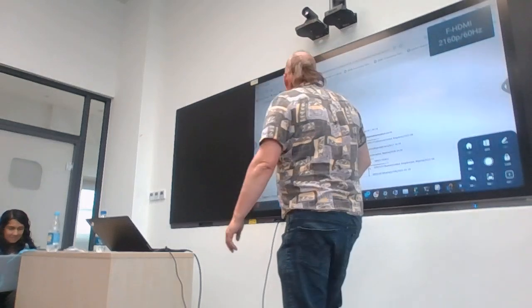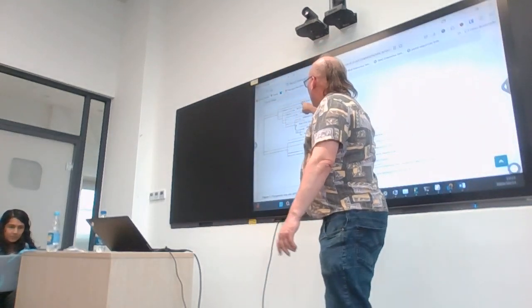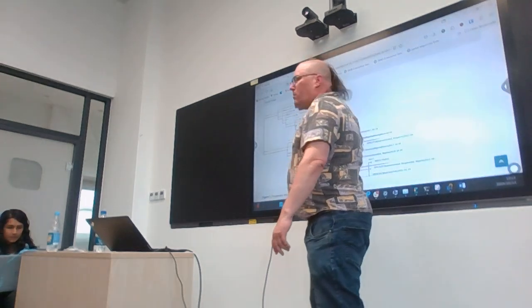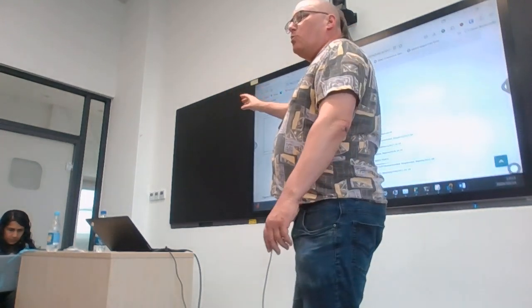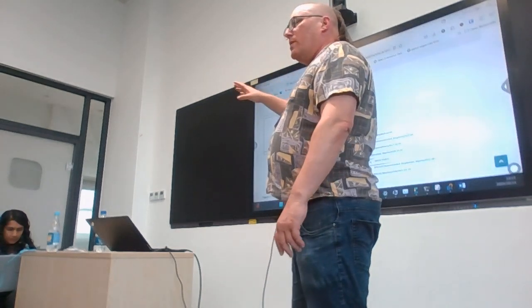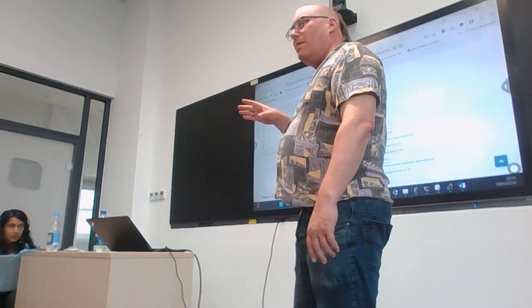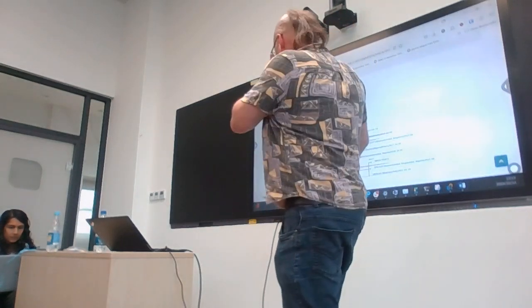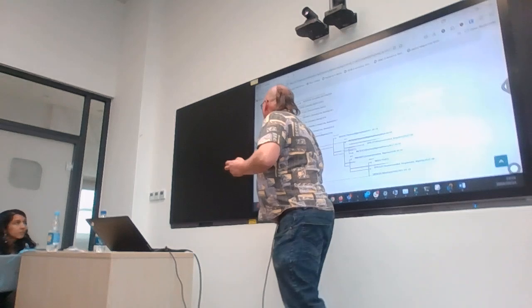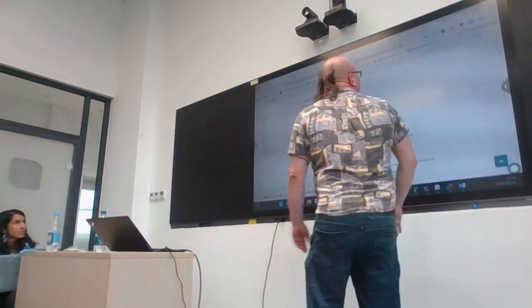So we see here the date, 2003. I don't know if people remember, there was a mpox outbreak in USA that was caused by the import of pets from Ghana, the pouched rats. That's this sample here. This is the assumed common ancestor over here. Sorry for touching the screen.